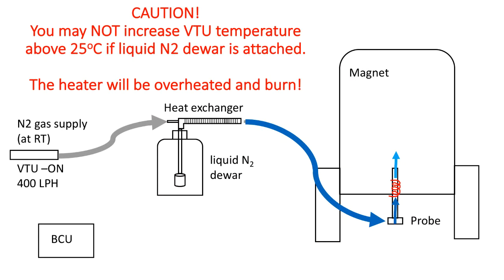When your low temperature experiments are completed, you need to bring the instrument back to the ambient temperature. It is very important that you should not set the VTU temperature greater than 25 degrees C when the liquid nitrogen dewar is attached. The temperature difference between incoming gas and the room temperature is very large, so the heater may be overloaded and burn out.